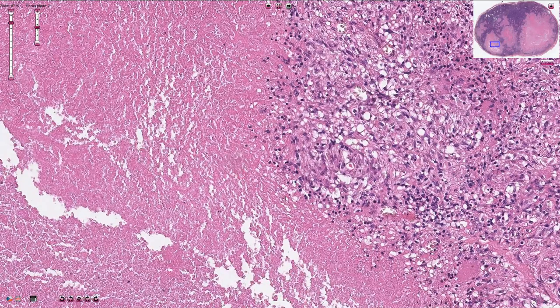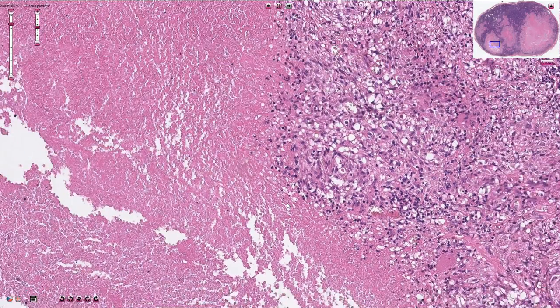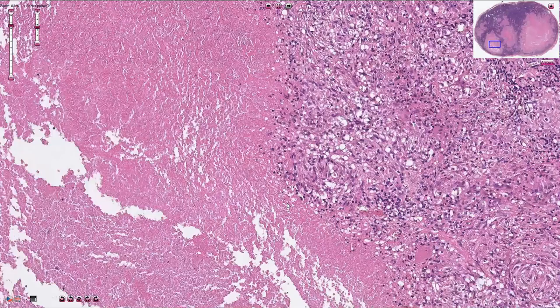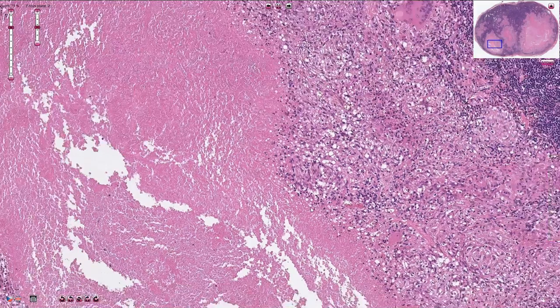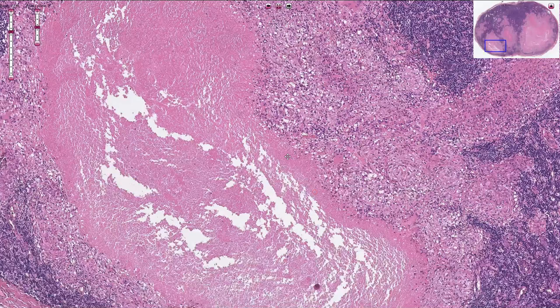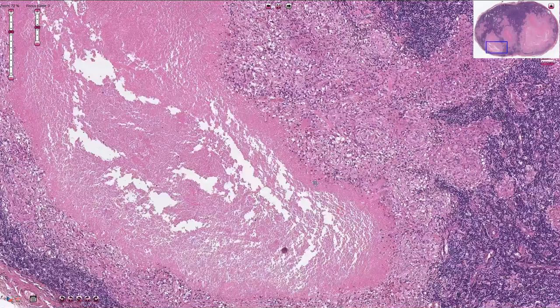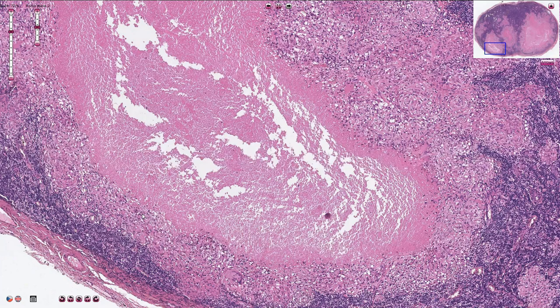Without identification of mycobacteria we cannot diagnose tuberculosis — we need to call it necrotizing granulomatous inflammation, because it could be something else. A similar appearance in the lymph node can be seen in cat scratch disease or tularemia, for example.